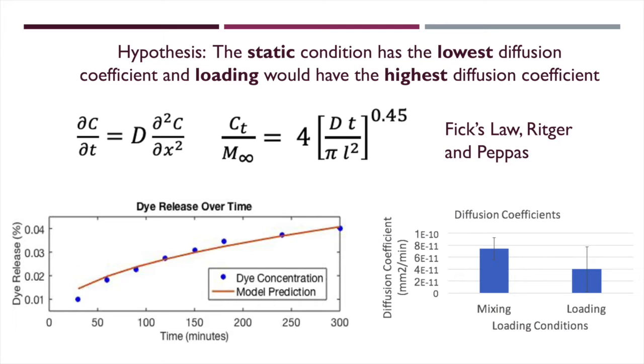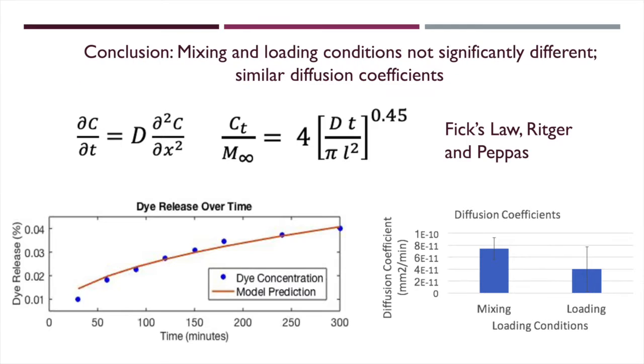As such, samples that do not require a mechanical stimulus will also experience similar benefits relating to mass transport. These benefits include effective movement of nutrients in and waste products out of the scaffold. Additional findings were unable to be attained due to the COVID-19 pandemic.